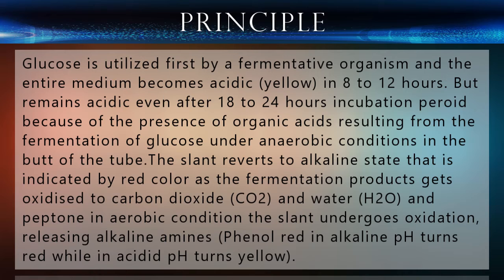If the organism is a non-fermenter of sugars, peptone is utilized as an alternate source of energy under aerobic condition on the slant, which makes it alkaline, indicated by the red color, while there is no change in the color of the butt. The reaction in triple sugar iron should not be read after 24 hours of incubation, because aerobic oxidation of fermentation products from lactose and/or sucrose will occur and the slant will eventually revert to alkaline state.